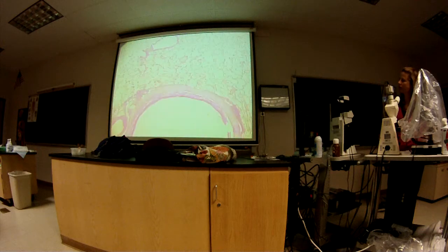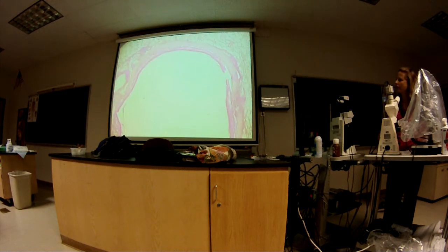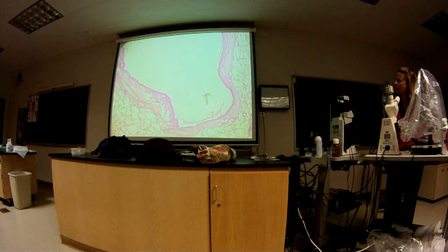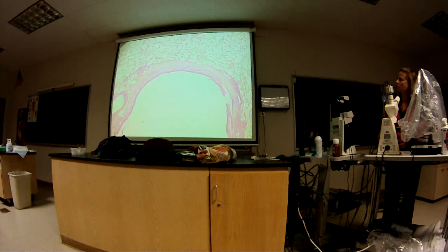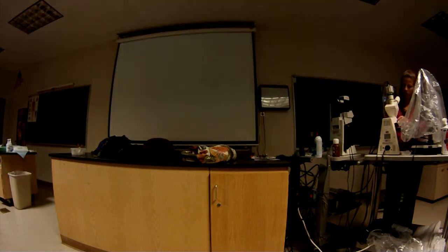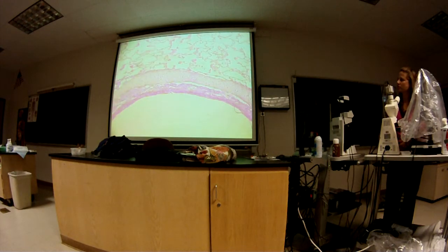There's the lung, so we're within the lung. You see the alveoli. And so here's the circular structure, somewhat oval, maybe. Okay, let's move a little closer before you decide what it is. Think of what your options are for a structure you might find in this.